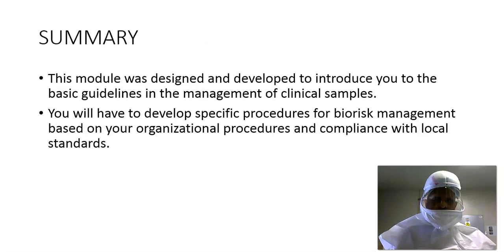To summarize, this module was designed and developed to introduce you to the basic guidelines in the management of clinical samples. You will have to develop specific procedures for biorisk management based on your organizational procedures and in compliance with local standards.